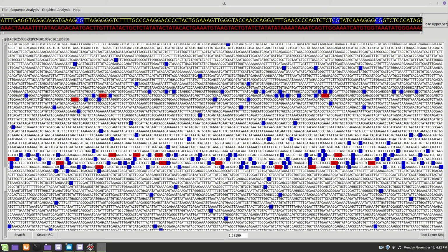It's going to be a lot shorter, but really it doesn't matter because most of what you're going to be doing is in the regulatory region, which I'm going to count as 1,000 base pairs ahead of the first CG. So I'm going to count here, and I go backwards 1,000 somewhere in here, and I'm going to take all of that down to the next gene, and that's how I took out the piece that you're going to get.